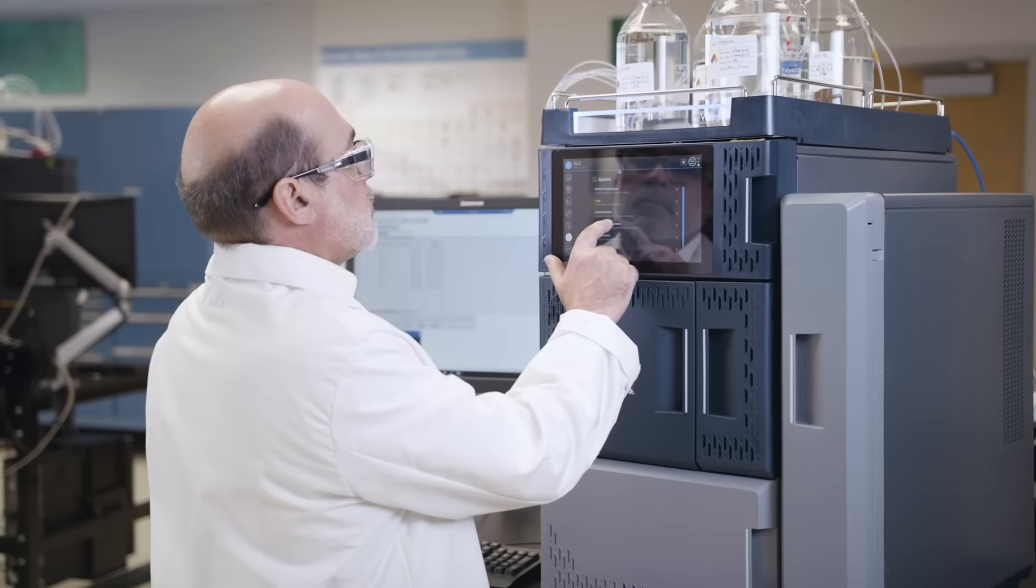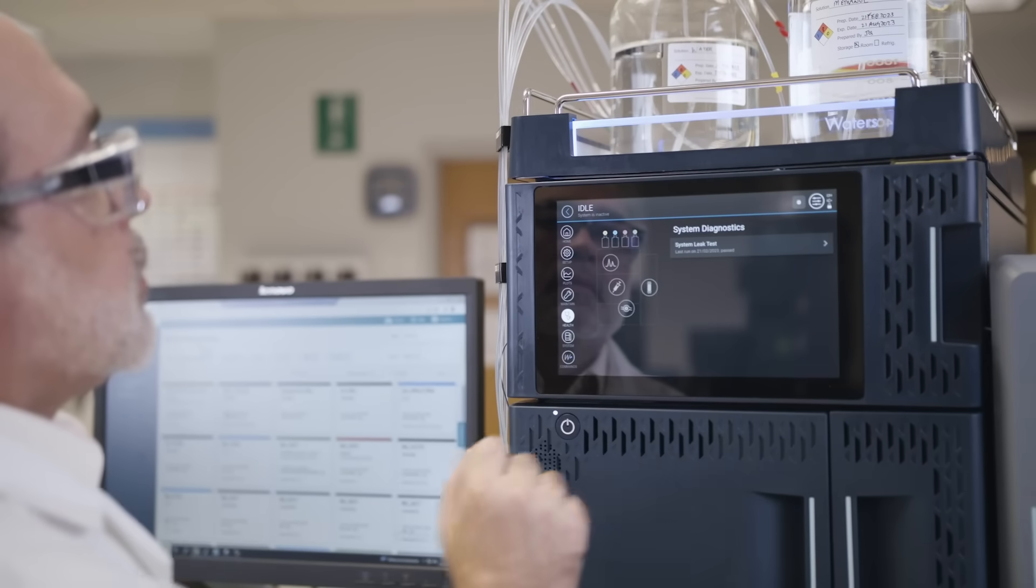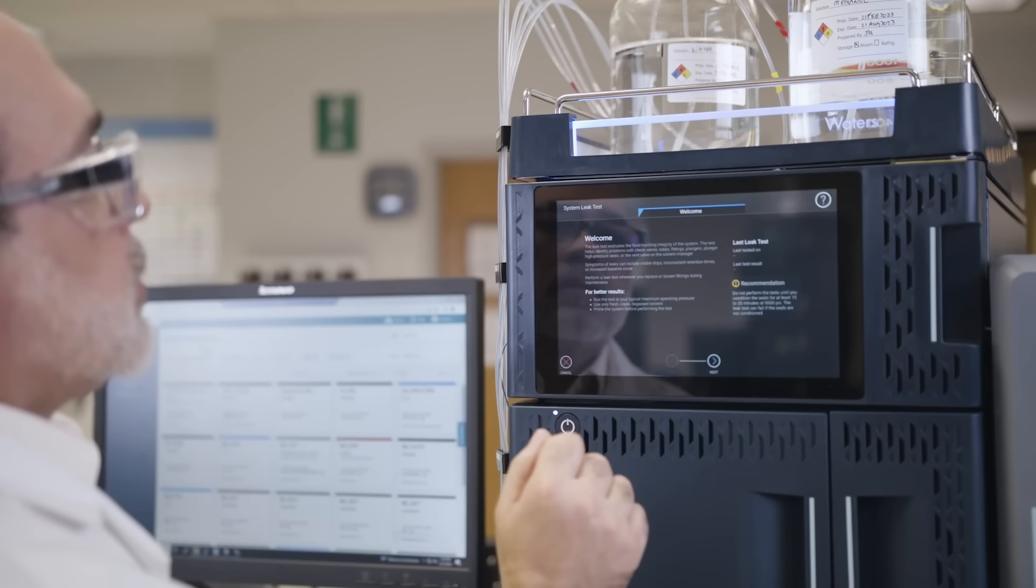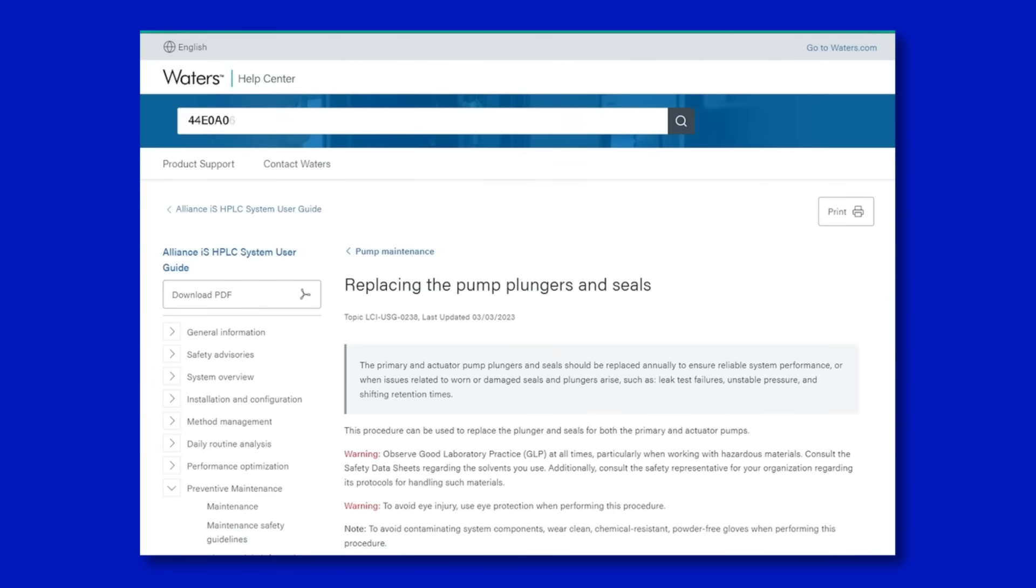The intuitive touch screen helps to guide your team through every stage of analysis, expedites learning, and brings your team up to speed. For faster decision making, the system provides quick, concise feedback with videos and help at your fingertips.